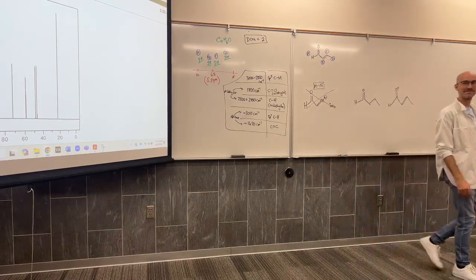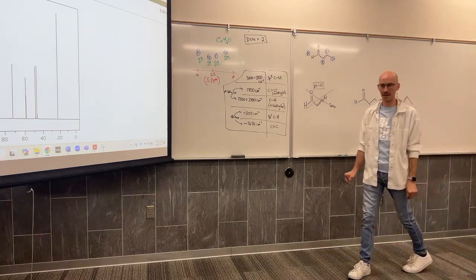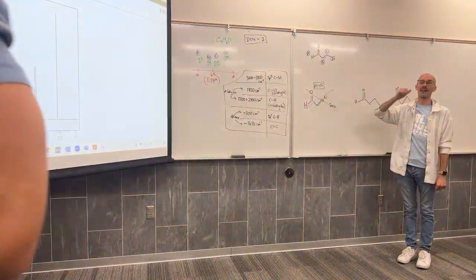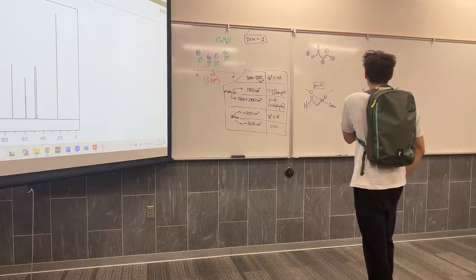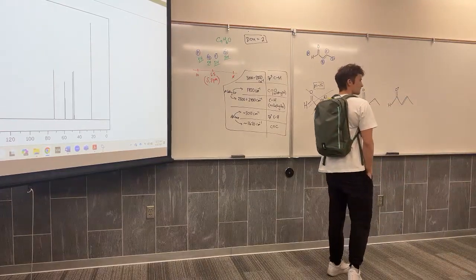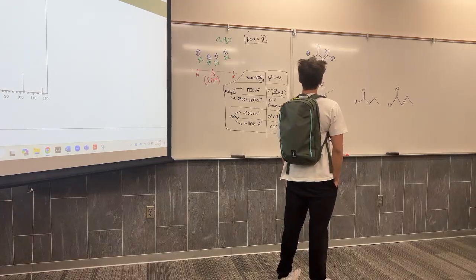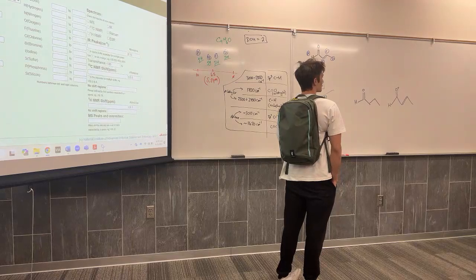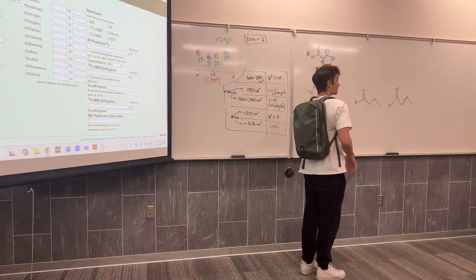For the one that I drew, would that be like what we were doing yesterday in lab, and this one predicts? Yes, exactly. You drew a plausible daughter ion. Possibly the base peak. I didn't actually look. The base peak is at, oh, this isn't the same molecule anymore. Is that 49? Yeah, basically. 49. I don't think 49 was it, but.